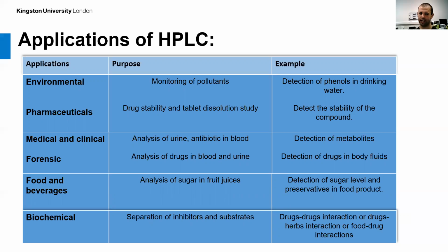It's been used in forensic application, analysis of drugs in blood and urine, and further in food analysis, such as the analysis of sugar level in food products.